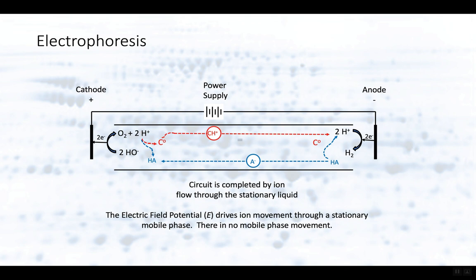And at the cathode, the electrode picks up two electrons, and it typically picks these up from water, or more importantly from hydroxide ion, and it produces a molecule from two hydroxide ions. It pulls that extra electron off, forces those two to combine together to become gaseous oxygen. In that process, it produces two protons. So the pH is lower at the cathode. Now those protons can equilibrate with both acids and bases.